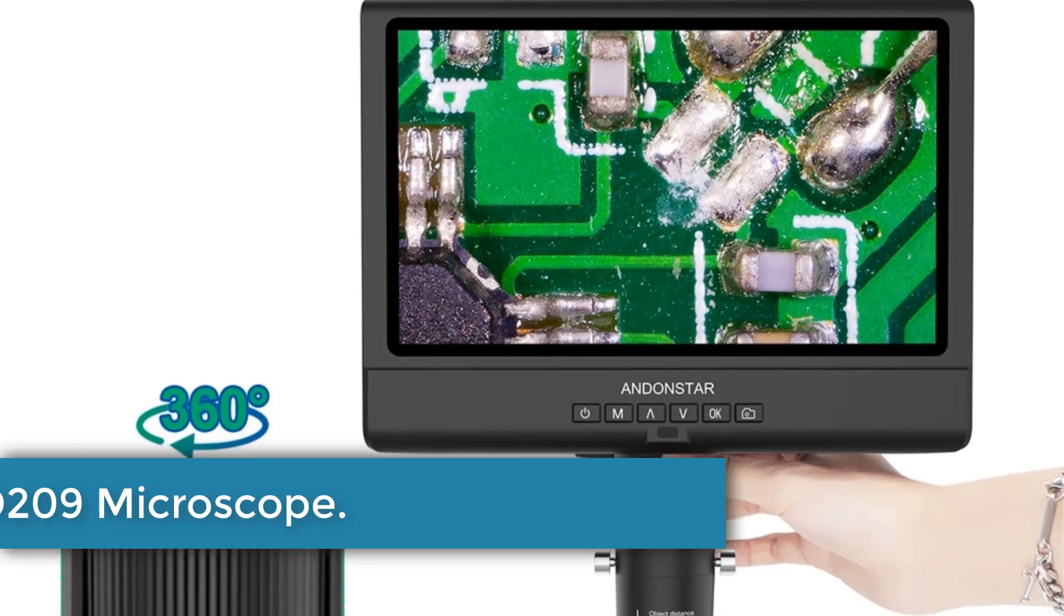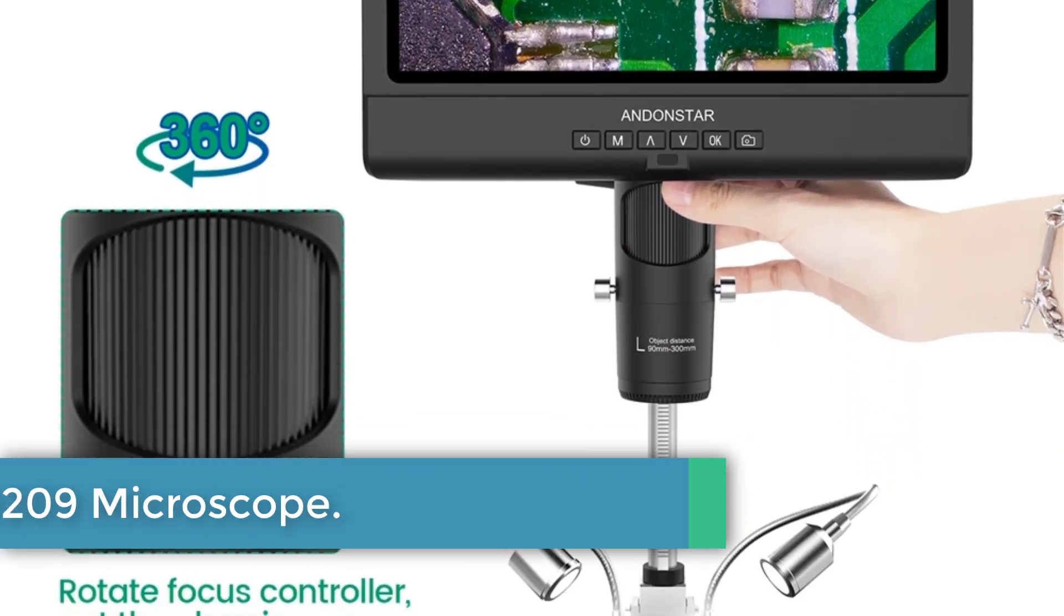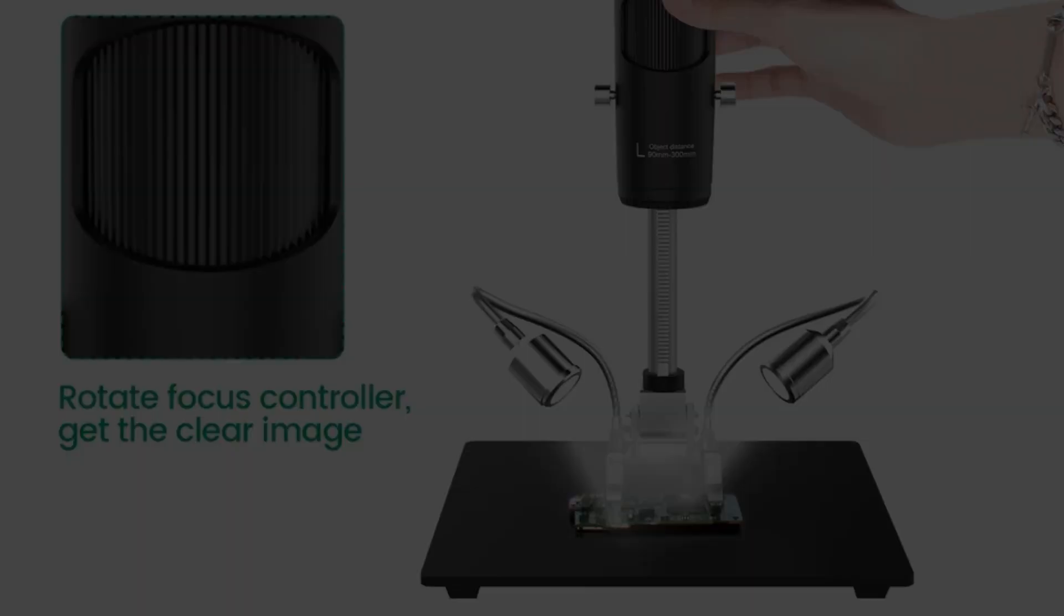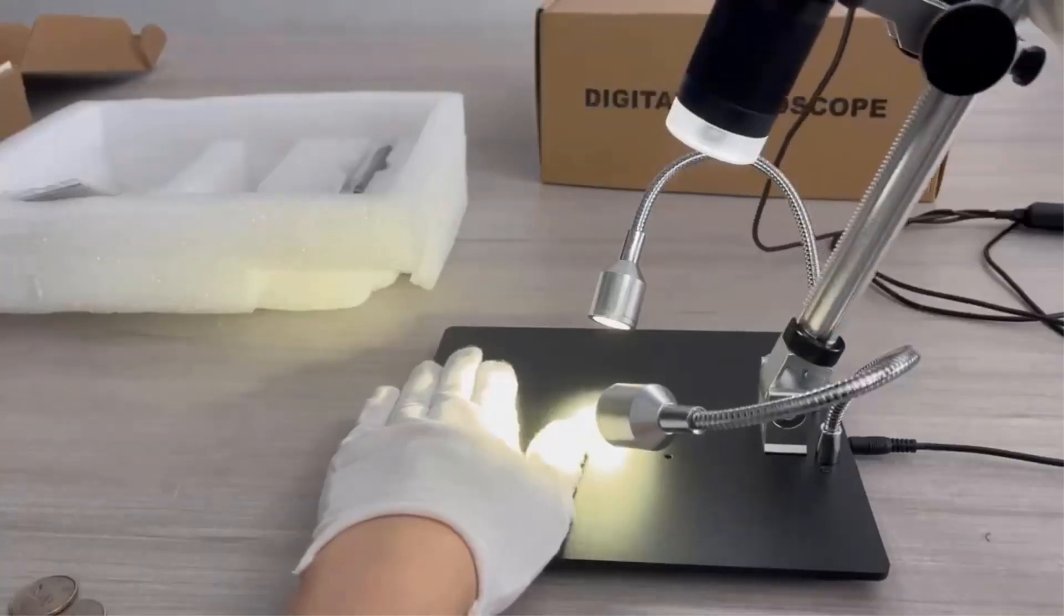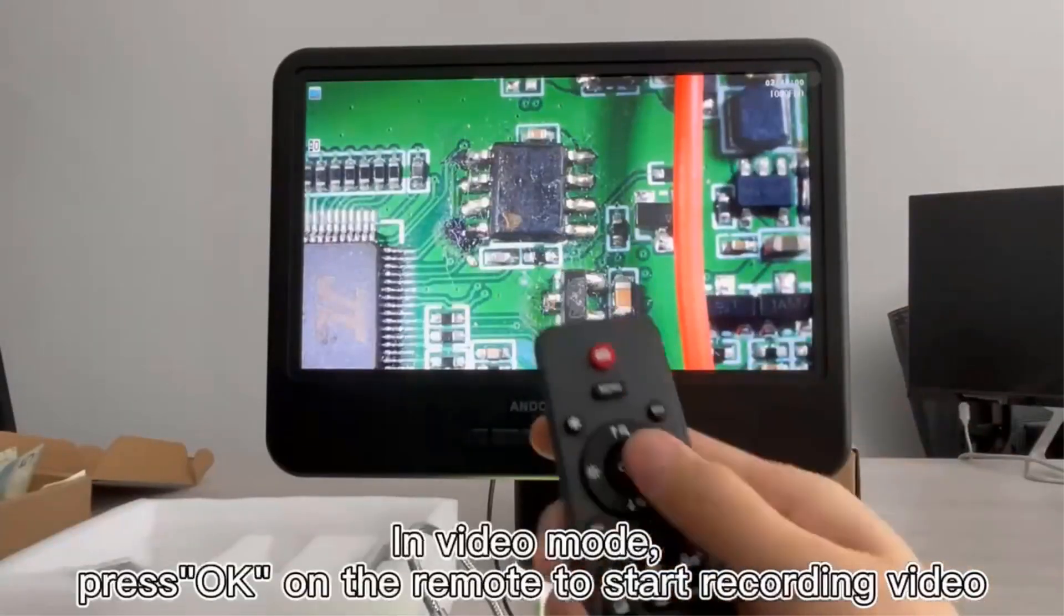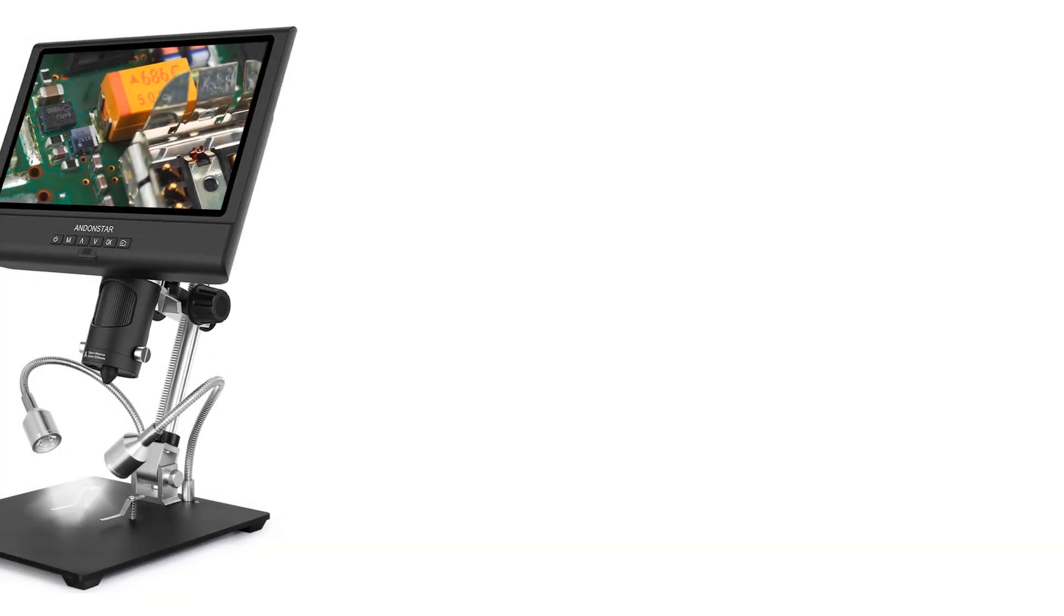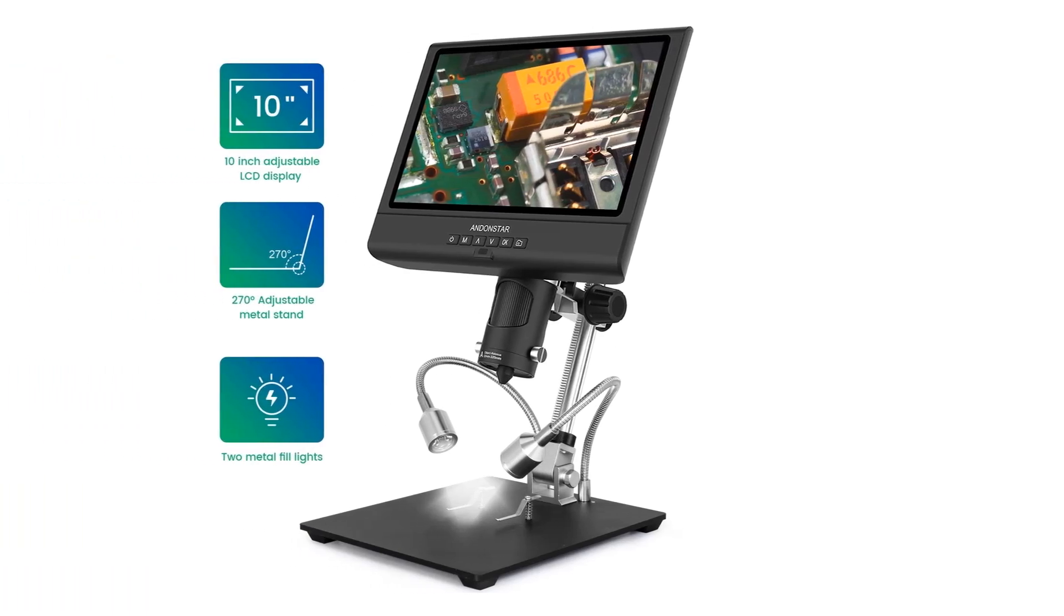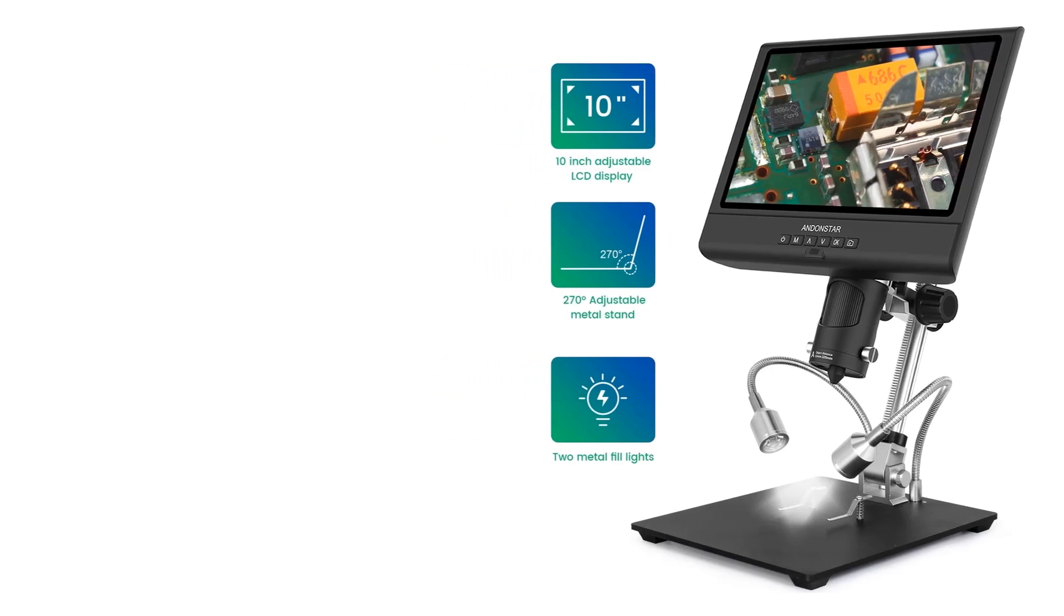Number 2: Andenstar AD209 Microscope. The Andenstar AD209 is a high-definition digital video microscope, featuring a 10.1-inch LCD display and a magnification range of up to 200x, making it ideal for tasks such as soldering, phone and watch repairs, and electronic inspections. Equipped with a 2-megapixel HD image sensor, it supports video resolutions of up to 1080p at 30 frames per second and photographic resolutions of up to 12M, 4032x3024, in JPG format.